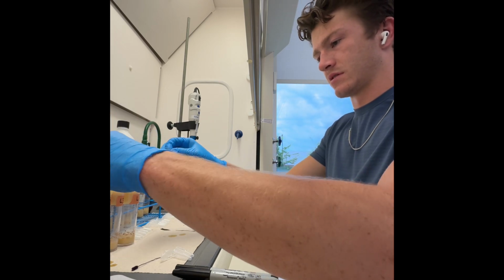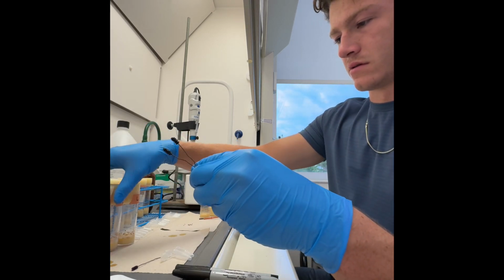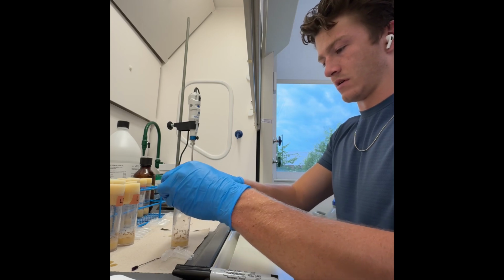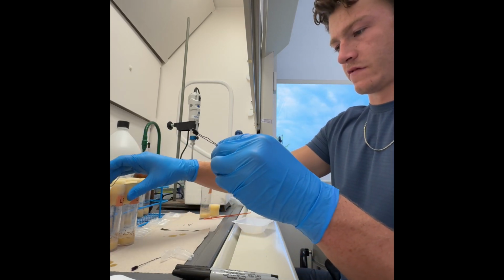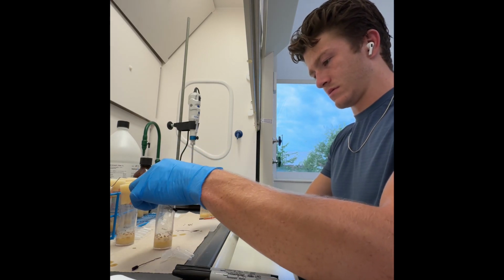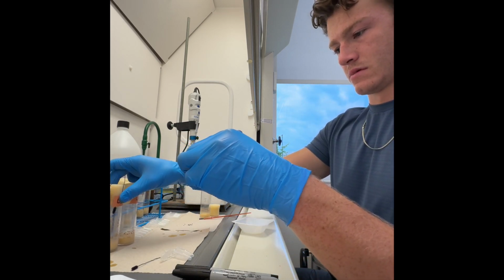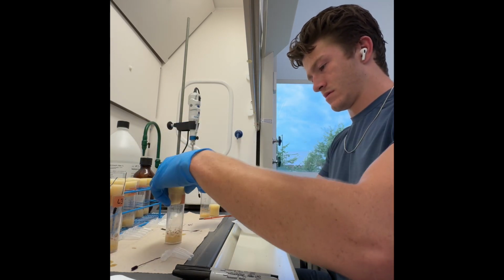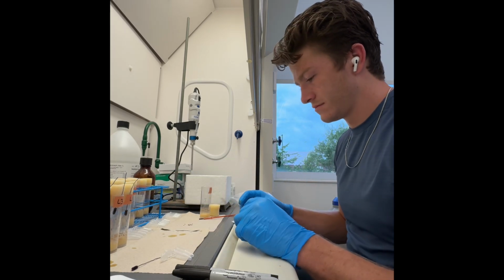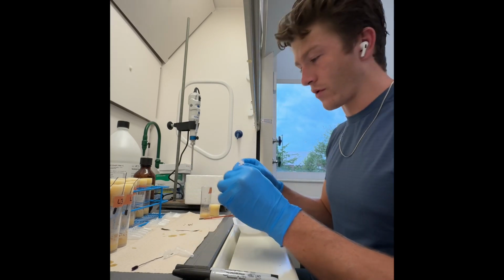this process significantly. So that's 1, bang, put that in there. Poor guys, only 2 weeks to live. There's 2, put that in there. Flying around like crazy, but that's good. I thought I actually overdid it. There's 3. There's 4. Alright. So this is control 4 now.